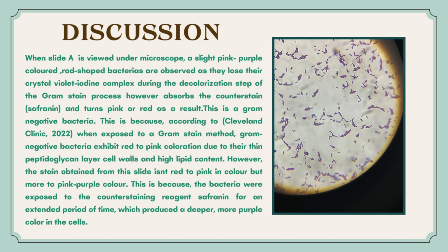purple in color. This is a gram-negative bacteria. This is supported according to Cleveland Clinic 2022. When exposed to a gram stain method, gram-negative bacteria exhibit red to pink coloration due to their thin peptidoglycan layer of cell walls and high lipid content.